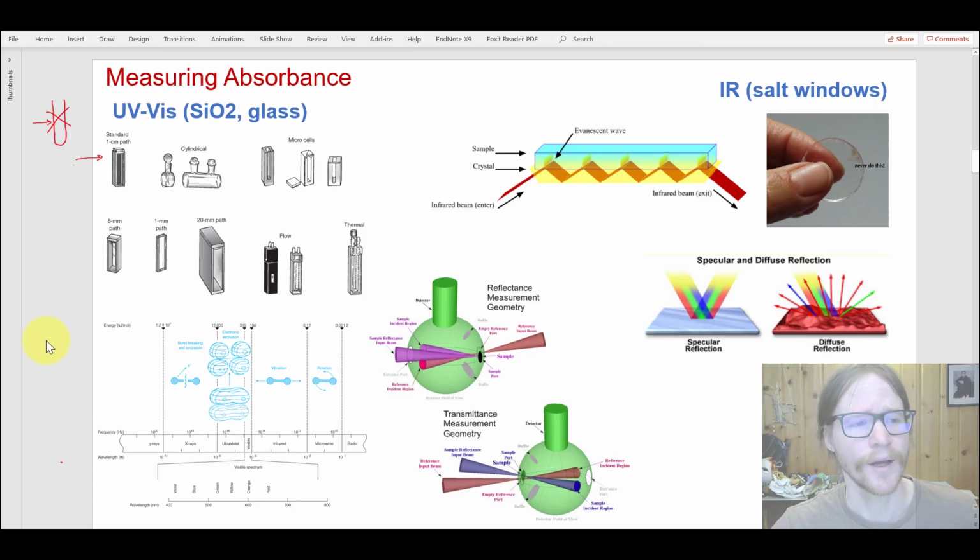Ideally, the two opposing sides are precision machined for flatness and super parallel, so you don't have one side that enters completely orthogonal and the other side that's 1 or 2 degrees off, which again would change the thickness depending on what orientation you have this thing.